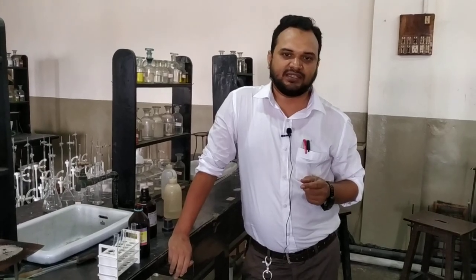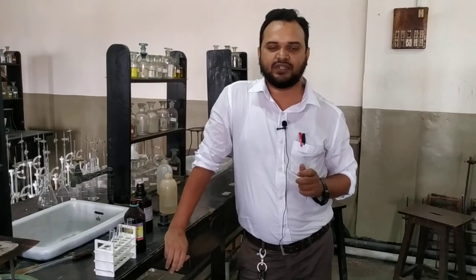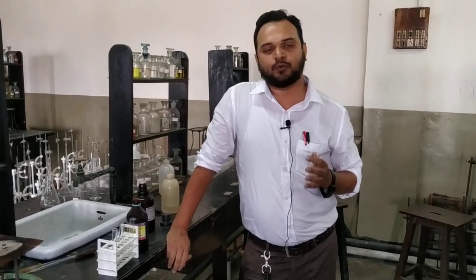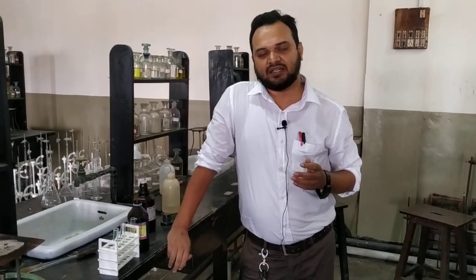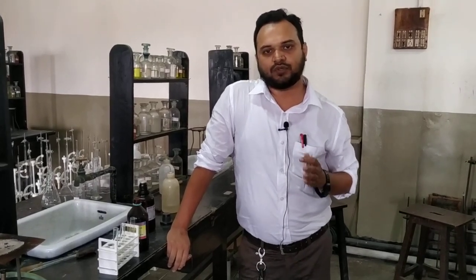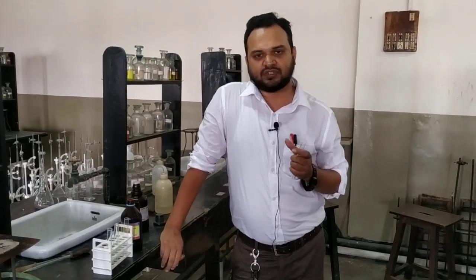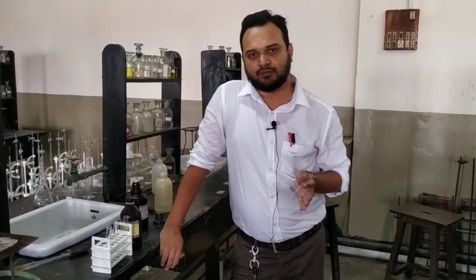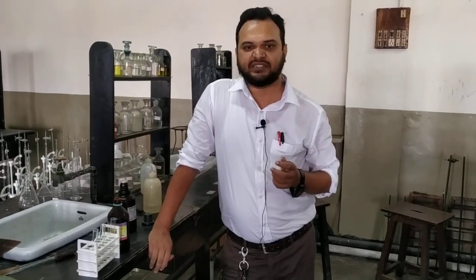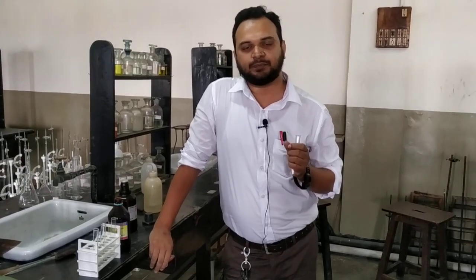When we take aniline, that nitrogen lone pair is in resonance with the ring, and this ring is highly activated towards electrophilic substitution reaction. So when we add bromine in aqueous medium, it undergoes substitution at ortho and para, and it gives you 2,4,6 tribromoaniline. This 2,4,6 tribromoaniline or 2,4,6 tribromophenol, due to its very high molecular weight, gives you a precipitate. For aniline, it gives a characteristic precipitate that is pinkish white.